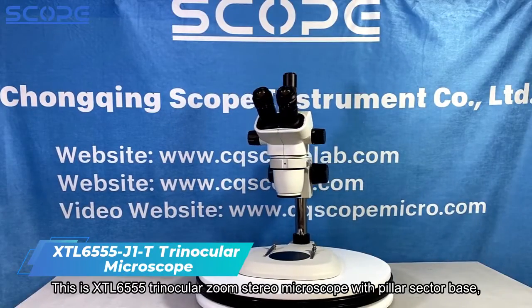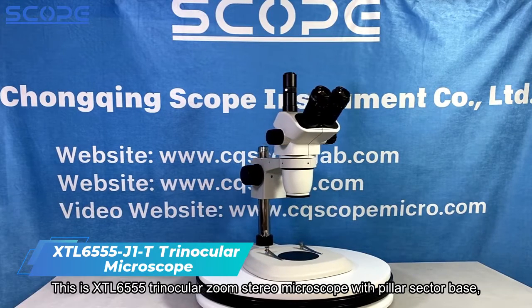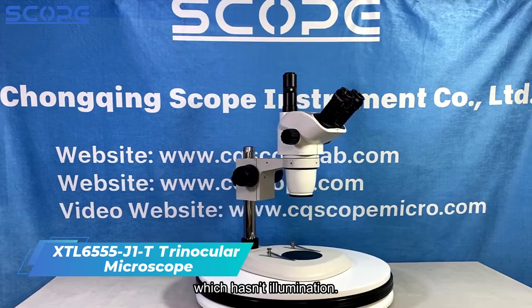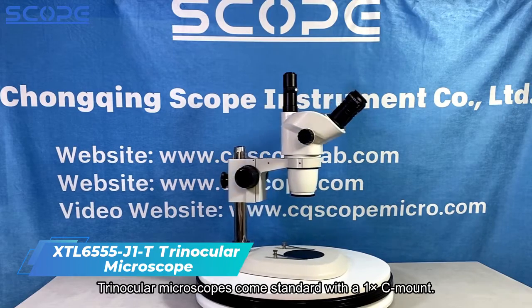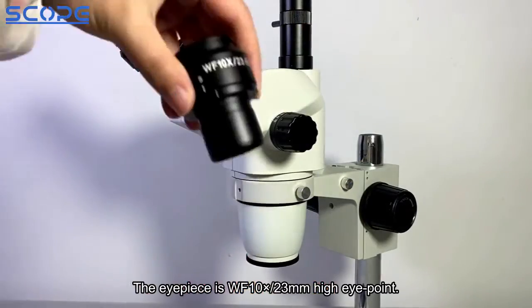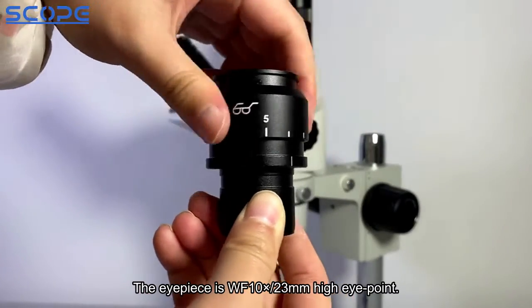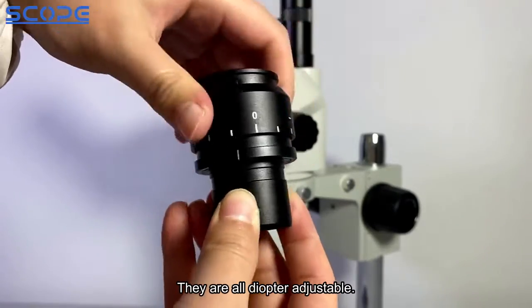This is the XTL6555 Trinocular Zoom Stereo Microscope with Pillar Sector Base, which has no illumination. Trinocular microscopes come standard with a 1x C-mount. The eyepiece is WF10x with a 23mm high eyepoint, and they are all diopter adjustable.